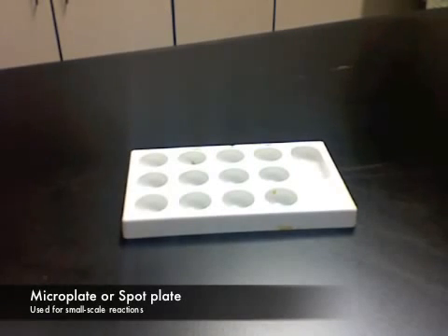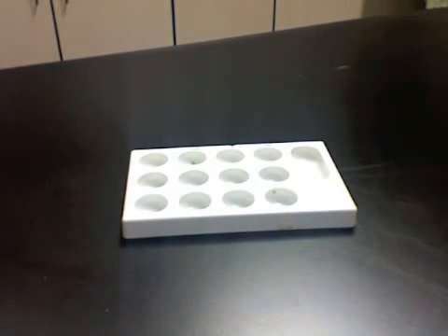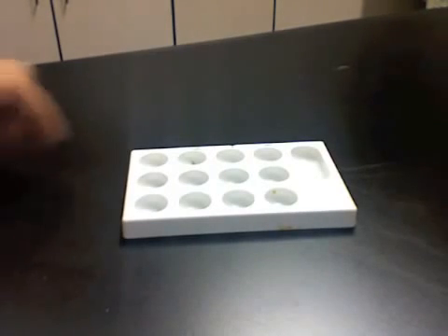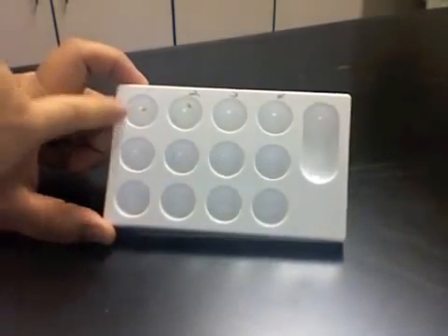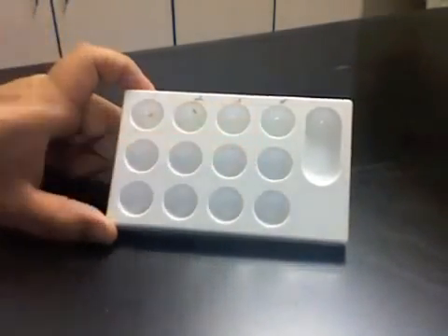This is a microplate, sometimes called a spot plate. If you don't have a whole lot of the liquid to react in the chemical reaction, you don't want to use a test tube, you can use a spot plate. A spot plate has things called wells. These are little depressions where you could put some liquid and just drop it in.